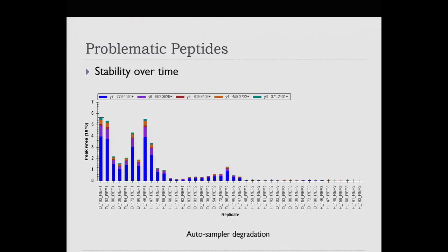So we expect very, very close CVs with a measurement over 48 hours, I think. And we don't want to see something like this where this is a 200-fold degradation. We would just throw this out as a candidate for quantification.